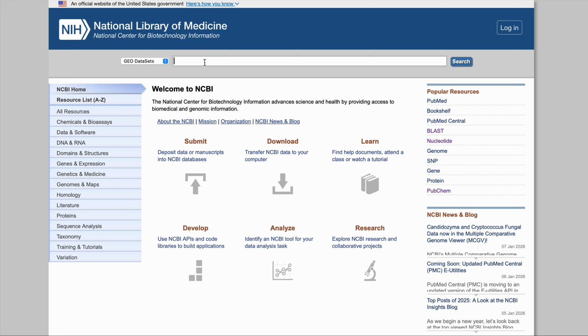If you have the accession ID, you can type that particular accession ID, which mostly starts with GSE, or you can directly type in the name of the organism that you want to search by. For this particular example, we can take Mycobacterium tuberculosis, which causes tuberculosis. I have the accession ID by my side for this demonstration, so I would go by that. Or if you search via Mycobacterium tuberculosis, you will get multiple entries under that. You can select any one of them, go inside, and see what paper was published and what information you are getting.